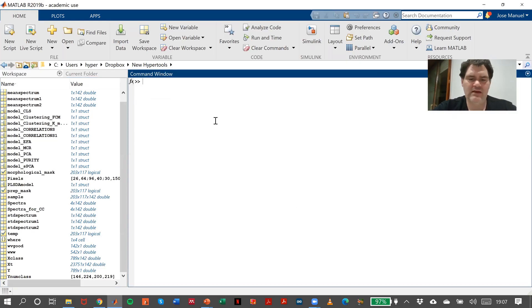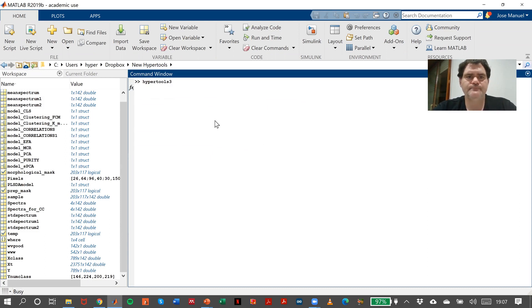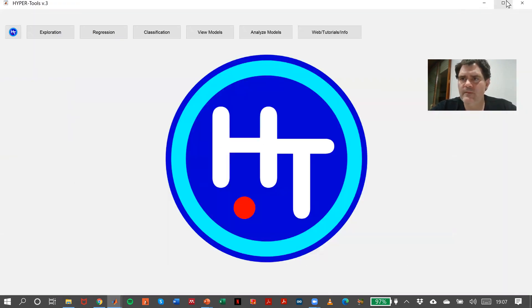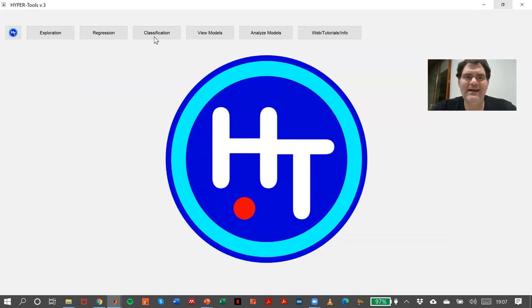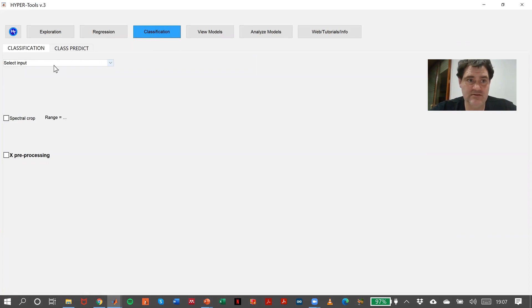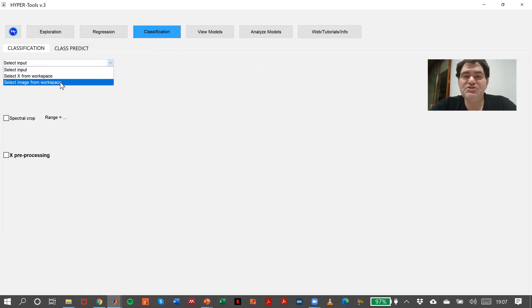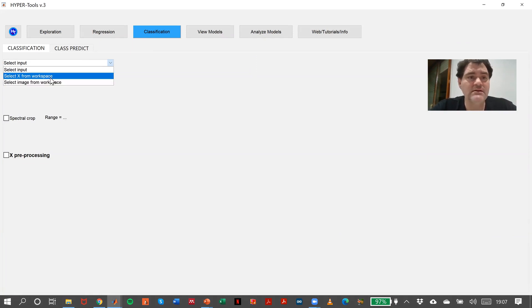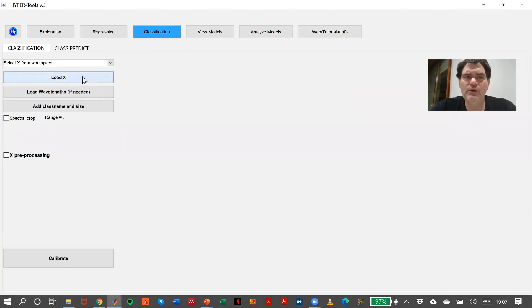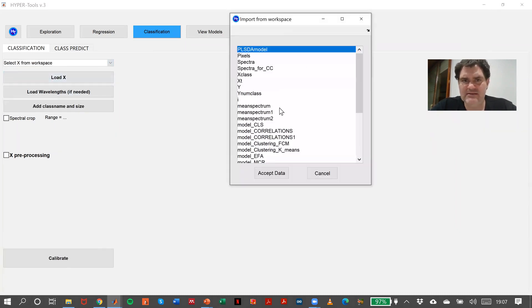So if we go to Hypertools and open it again, we can go directly to the classification tab. There are two ways of inputting our references: from X from a workspace, or if we have an image we can use as a calibration image, we can use that. I will show you both ways. From X, we have to load X — as I said, it is X class.